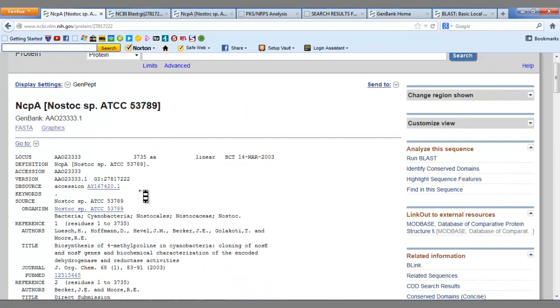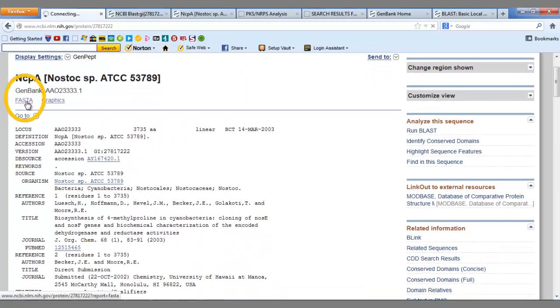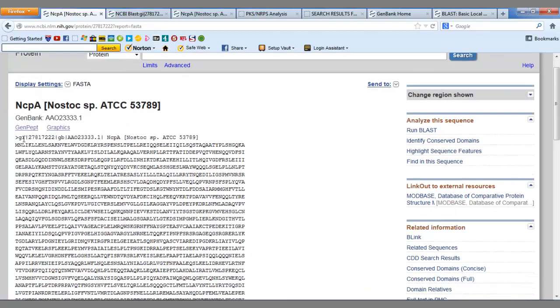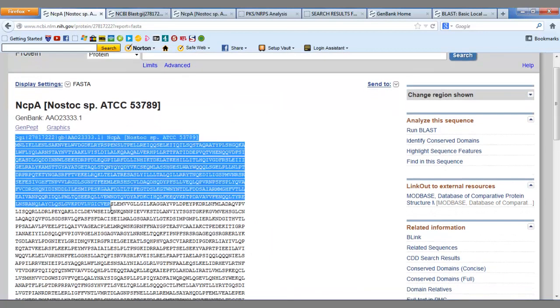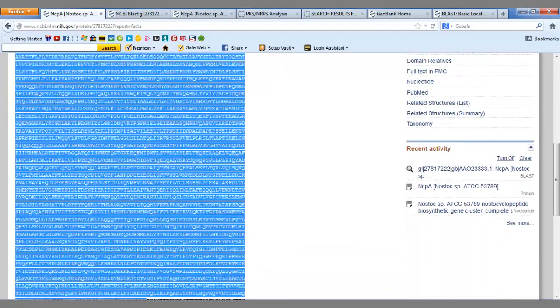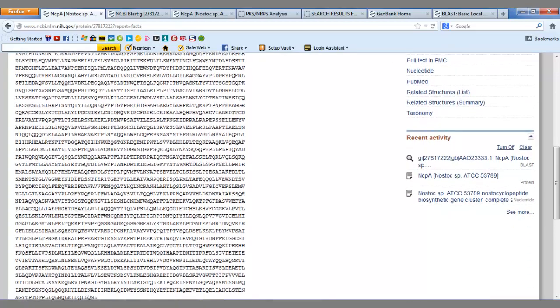BLAST also requires a FASTA sequence, so we copy and paste this sequence into BLAST. Bear in mind we must use Protein BLAST because this sequence contains amino acids.